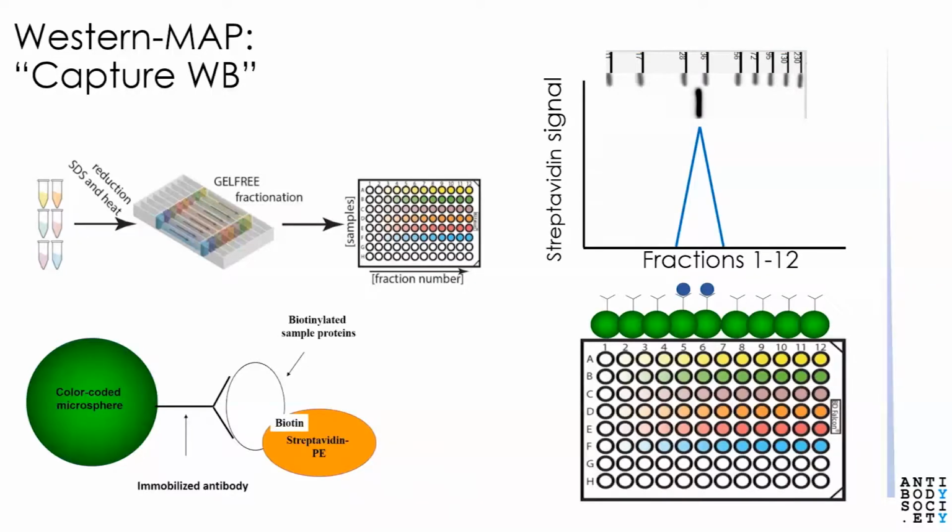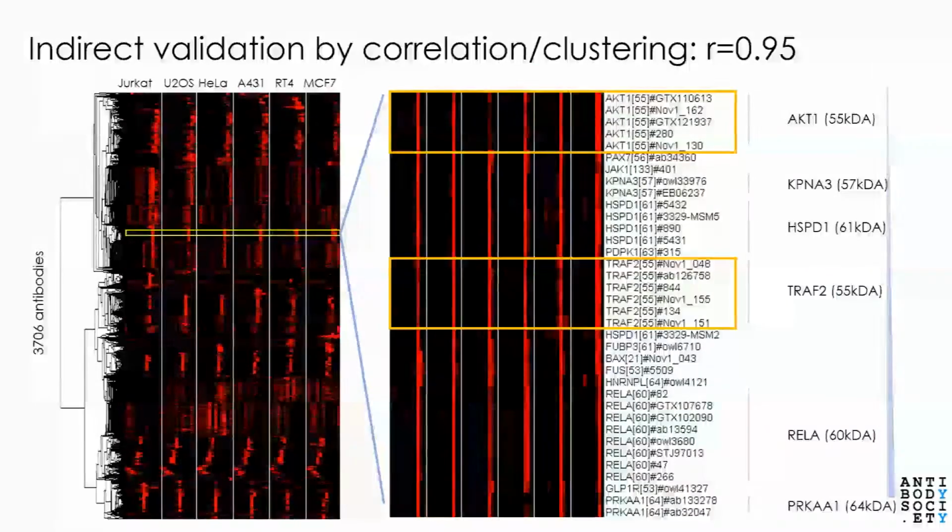An important difference between Western blotting and antibody array analysis is that the antibody array analysis and flow cytometry yield data in a numerical format. So we can not only work with thousands of antibodies at the same time, but the results we get are also qualitatively different because we obtain numbers. And in the next slide, I'll show you how this can be used.